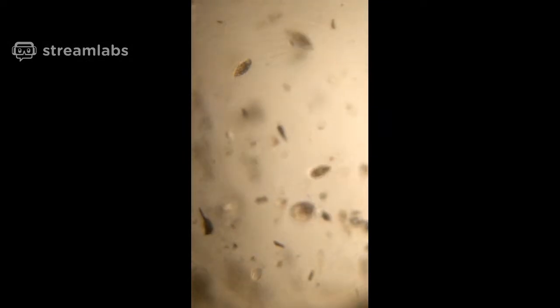Look, what happens is when there's less food in the medium, some cells become giant like this, and they just become big open mouths, like you see here, right? And then these big open mouths, they swallow little guys, right? They get their food, then they divide and become small again. And it's fascinating to watch these. This one is actually a mini giant. There are ones that can be 3-4 times bigger than these other cells that you see there.